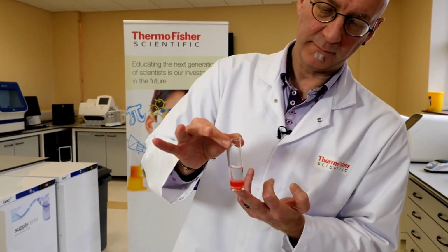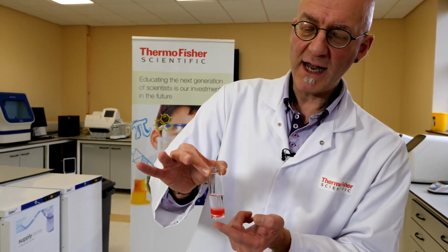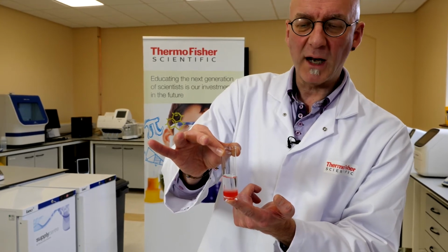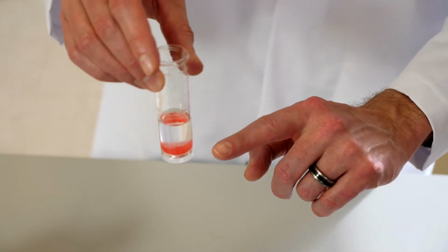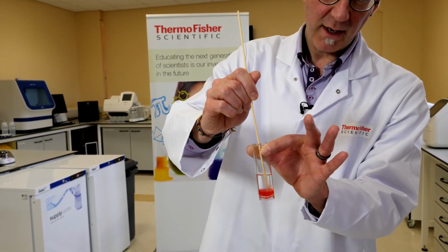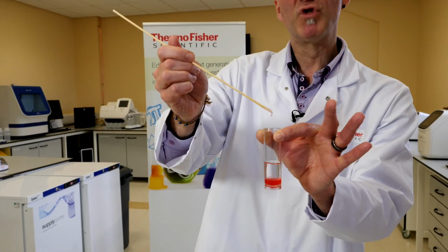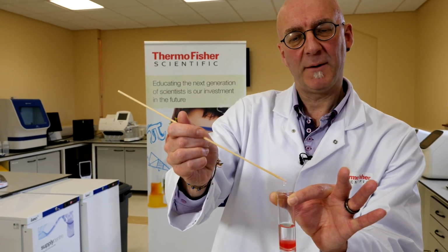What you will see now is we have our DNA solution at the bottom, we have our ethanol on top. What we have now is what we call an interface, where the solution underneath meets the alcohol on top. That substance that looks a little bit like, I've heard it described as candy floss, looks a little bit like cotton perhaps, that is DNA. That is DNA that's coming out of solution. What I'm going to do is take this skewer and very carefully spool that DNA out of solution. And you can see that that gloopy white substance that I have on the end of my skewer is strawberry DNA.